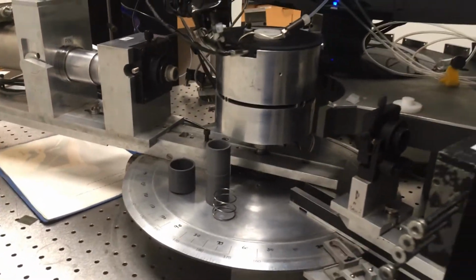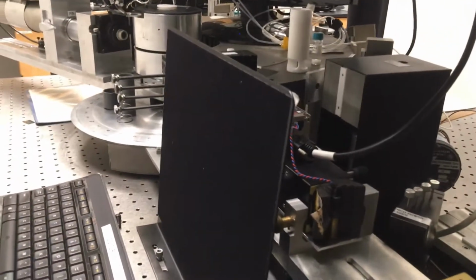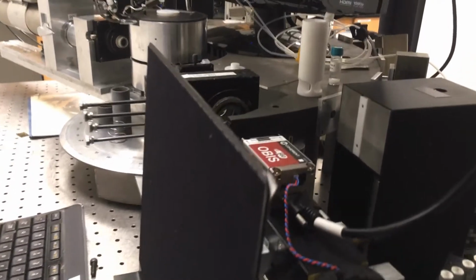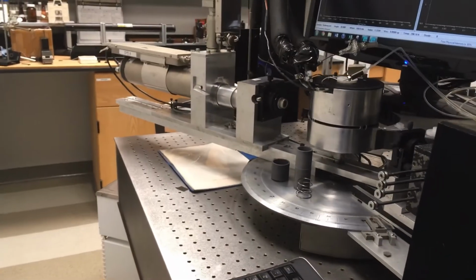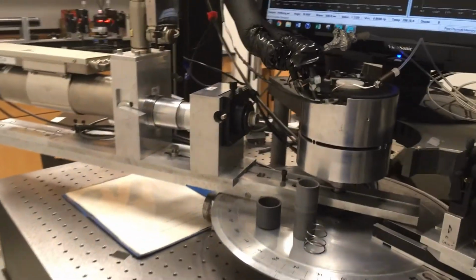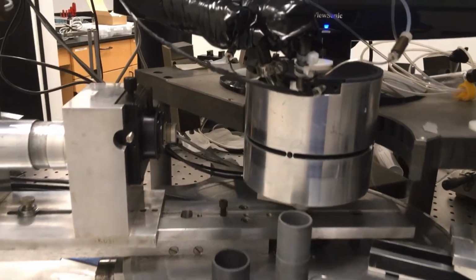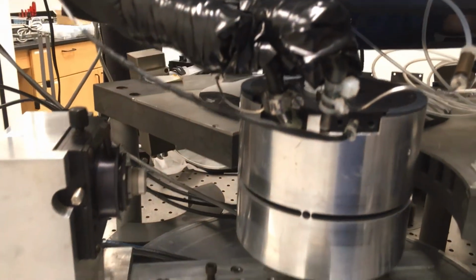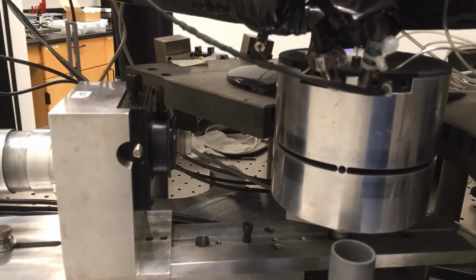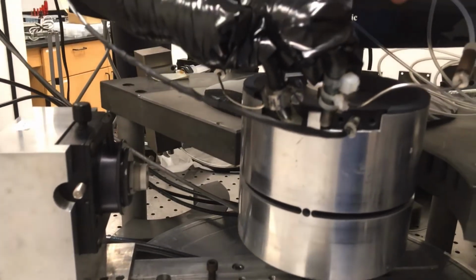Here is where the action begins, really, with this laser at the back. Actually, we'll probably mostly use this smaller laser. It's called the Obis that you can see there. And that light goes in a normal experiment into that big cylindrical center, and a cell is put in just like that. It's no big deal to put them in.